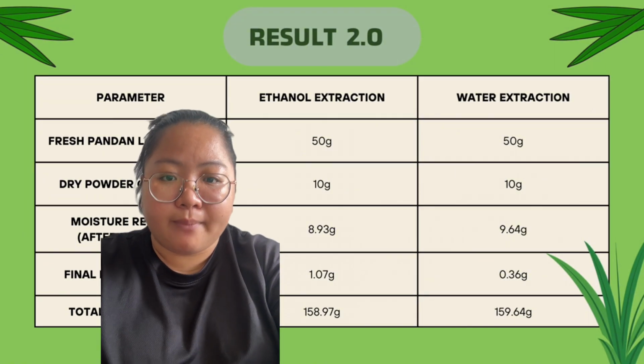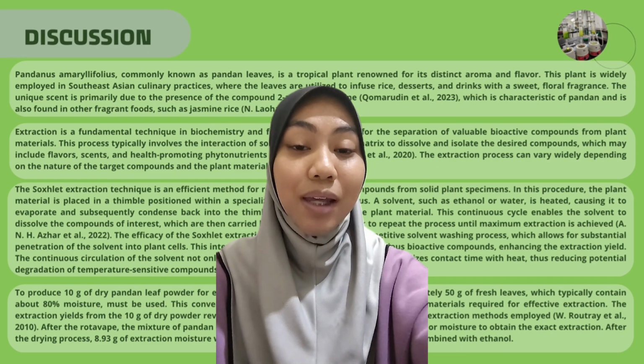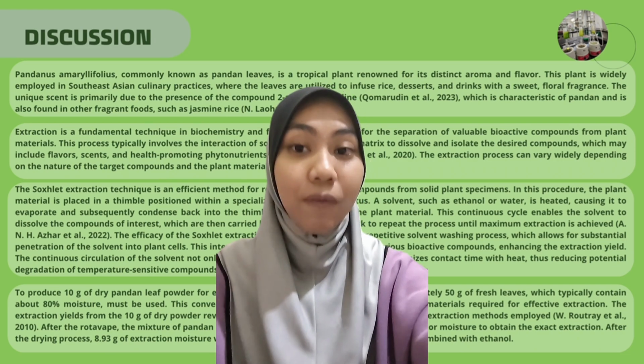159.64 gram. Hi, my name is Narsha Isha, and my matric number is J22A3020. Today I would like to present the discussion on crude extraction from Pandanus amaryllifolius, which is pandan leaf.